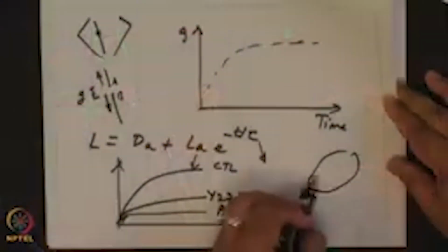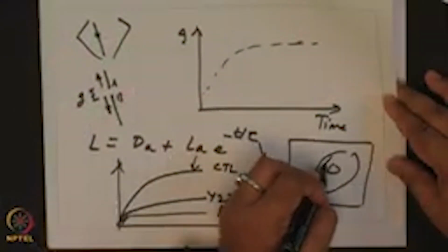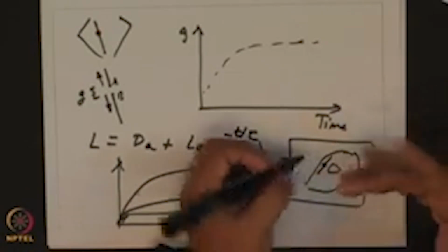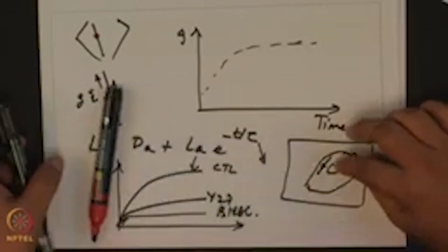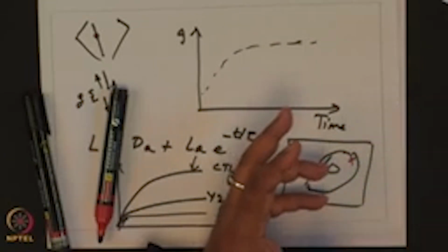Using this experiment, Sanjay Kumar demonstrated that when a cell is sitting on a compliant substrate and a single stress fiber is ablated, because the substrate acts as an elastic link for two different points within the cell, there is global rearrangement in the cell as a consequence of the single ablation.